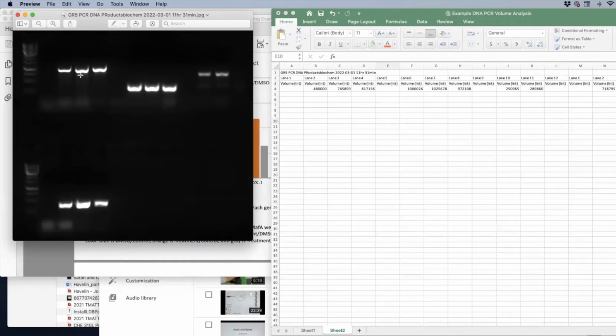So this band has roughly twice the amount of light as this one. Does that make sense? I think I mentioned this in each of the presentations, like my mock numbers weren't exact because I made them up just to walk you guys through the process, but the data you actually get from your gels is representative of this stuff.